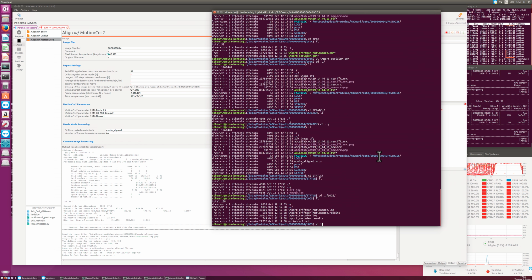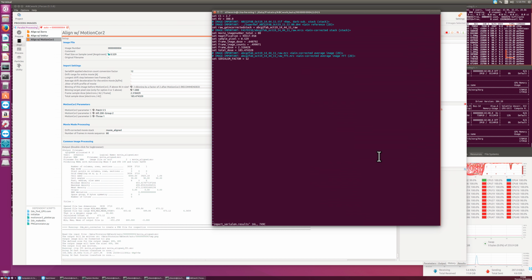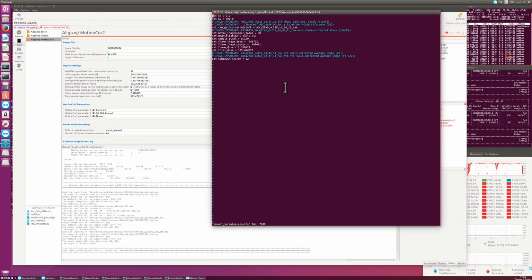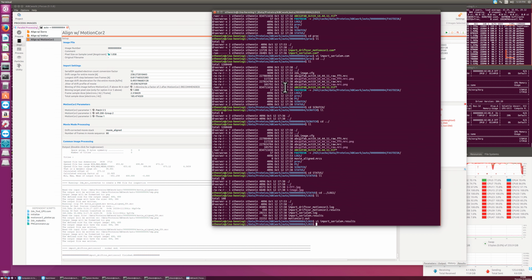Okay, I look at the results file from the other one. There's the unpacking results file. And this one determines some parameters and defines some images with nicknames, as we discussed. And the GUI will then watch for these and interpret this.